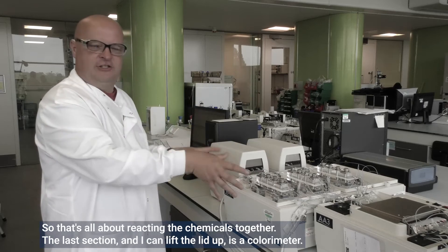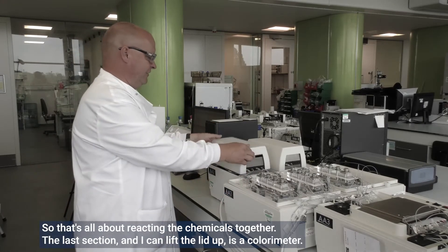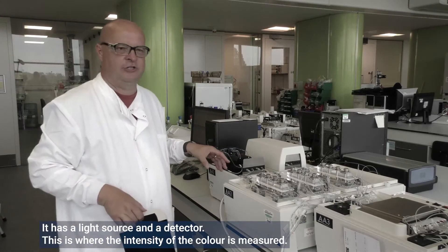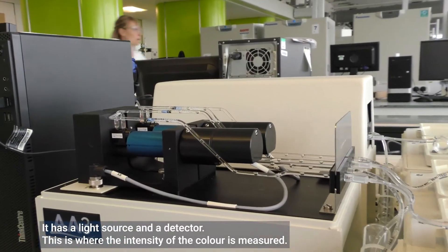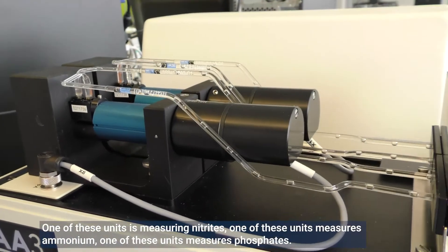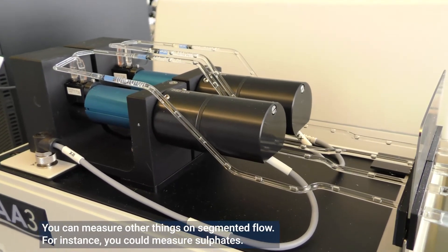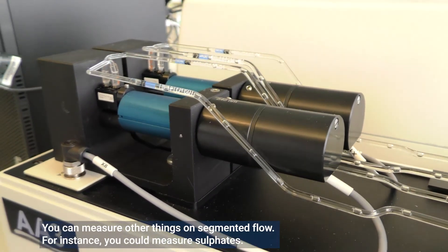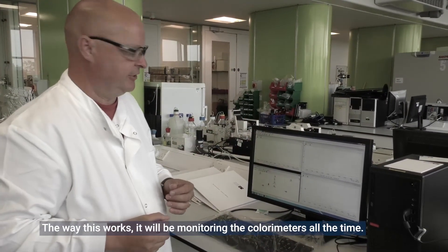The last section — you can lift the lid up — is just a colorimeter. It has a light source and a detector, and this is where the intensity of the color is actually measured. One of these units measures nitrite, one measures ammonium, and one measures phosphate. You can also measure other things on segmented flow, for instance sulphate. The instrument will be monitoring the colorimeters all the time.